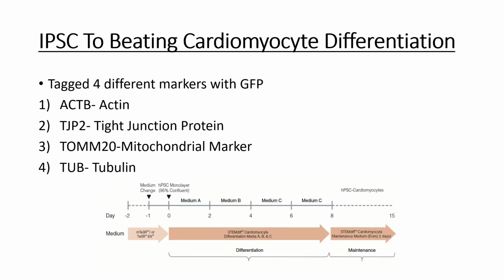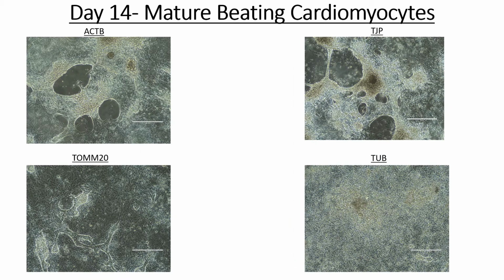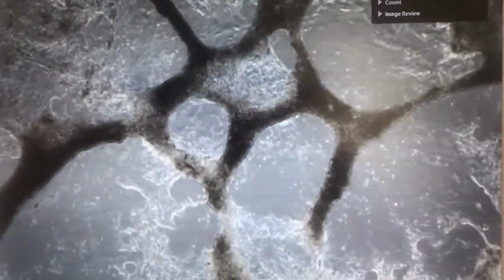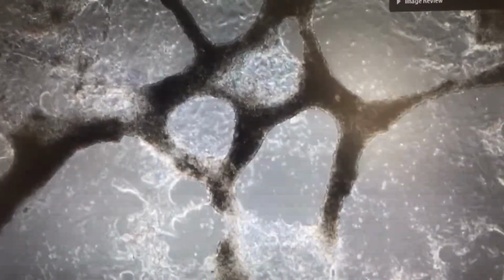Another thing I did over the summer was developing an induced pluripotent stem cell to beating cardiomyocyte differentiation protocol. And here's just a few pretty pictures of those basically. And here's actually a video of them beating on the Petri dish.